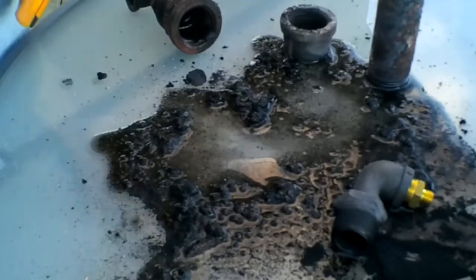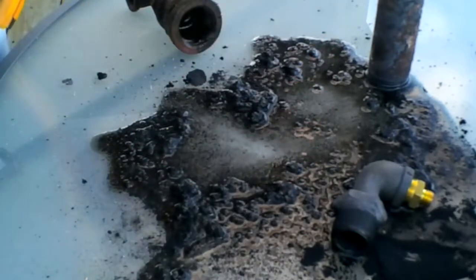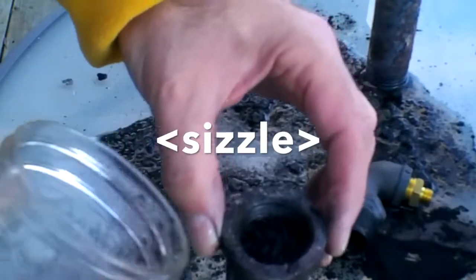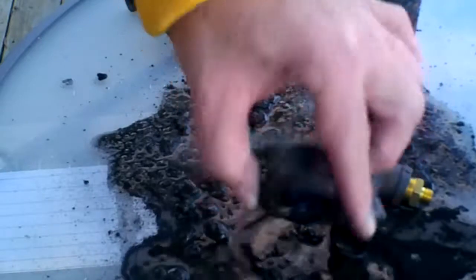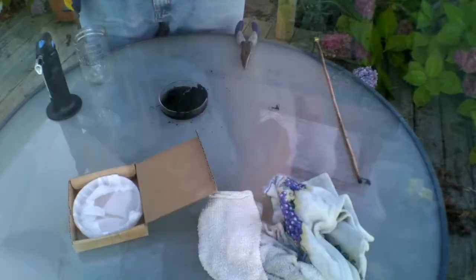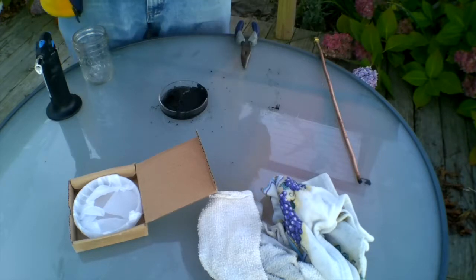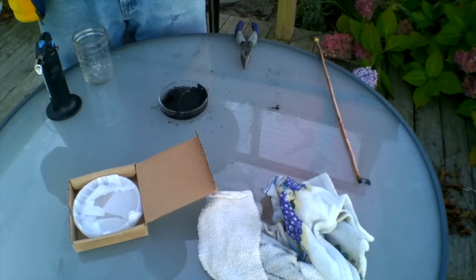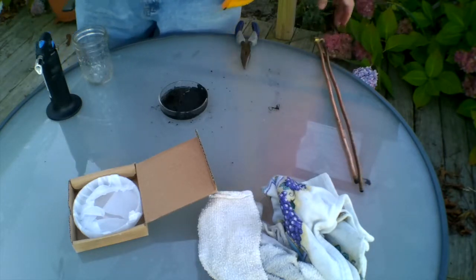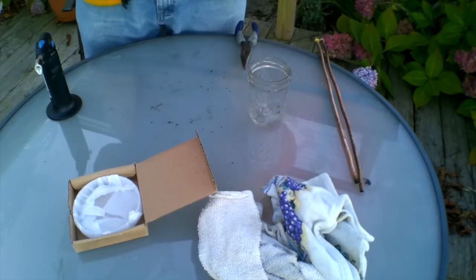Okay, well, the fact that I managed to produce it doesn't mean I managed to produce it quantitatively, so I'm not done. Oh yeah, oh yeah. There was definitely potassium in there. I just got to figure out how to make more of it. Well, I never actually saw potassium come out of the brown potash retort, but I heard potassium in the brown potash retort. So as a proof of concept, I think it may actually be possible to do this. I'm just going to have to try again.